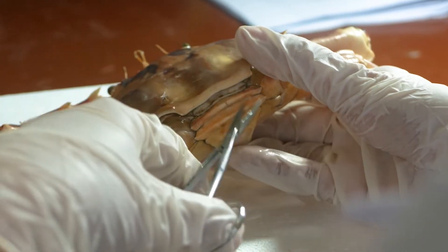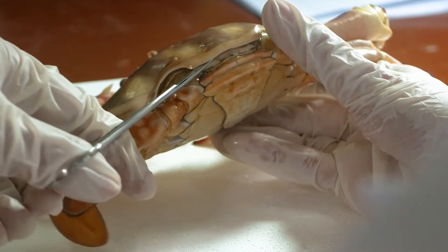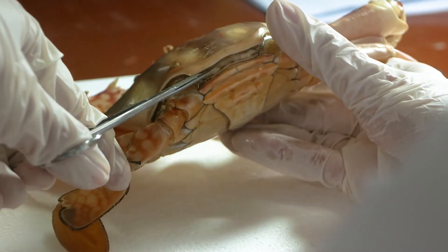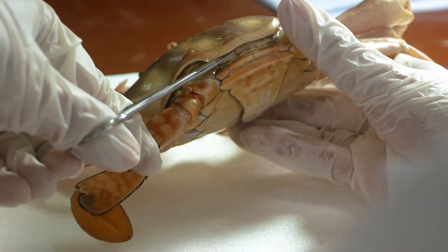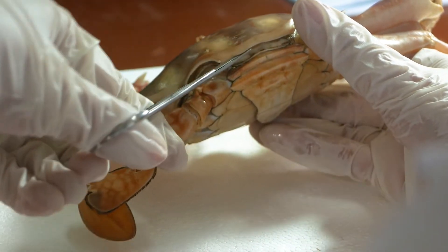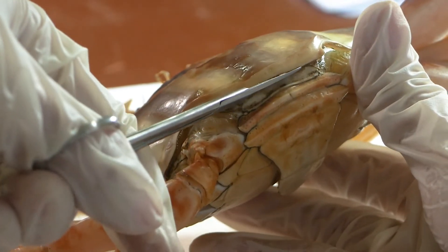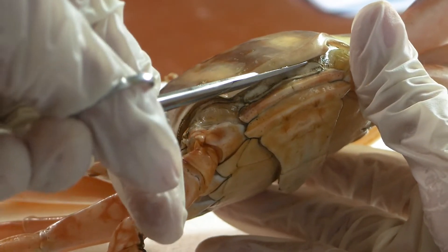Insert the iris scissors into an angle of the joint between the cephalothorax and the abdomen. A thin layer of tissue that runs along is called the dorsal line. Cut it using your scissors, as close to the edge as possible, to the outer edge of the dorsal carapace of the cephalothorax.